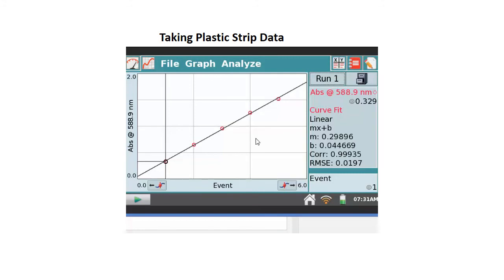What do you do next? Grab a different color and go through the same process with it, and pay attention as you go through it. You might ask yourself questions like, well, I wonder if the slopes are going to be the same, whether I'm green, yellow, blue, whatever. I wonder if the slopes depend on wavelength. You can look at things like that if you want to. So this is pretty much the LabQuest part of this. So what I'm going to do now is take us over and look at what it is we're going to do with those data once we have them.